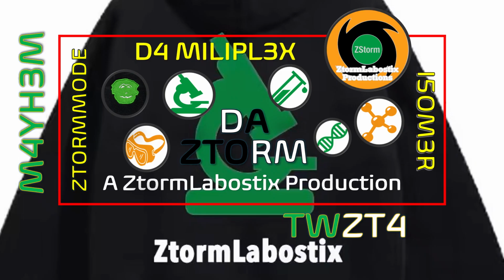Flow cells in the MinION technology contain the proprietary sensor array, an application specific integrated circuit, and hundreds of nanopores where DNA or RNA passes through and can be monitored. As part of the sample preparation, Oxford Nanopore sequencing technology provides a variety of library preparation kits to suit whole genome research or targeted genomic investigation.